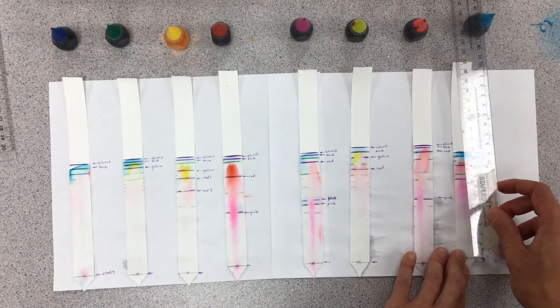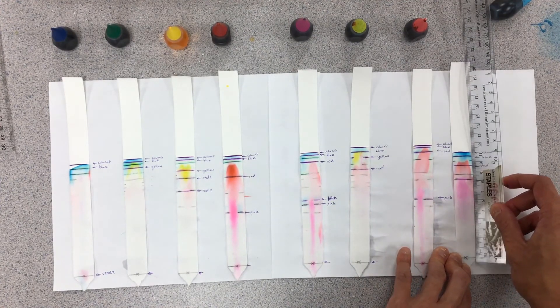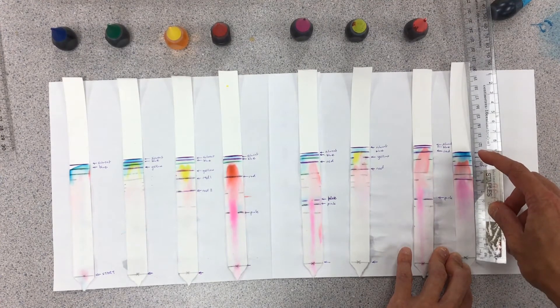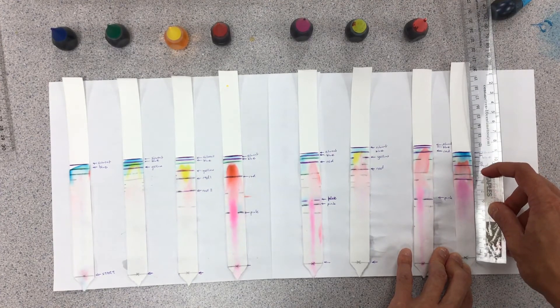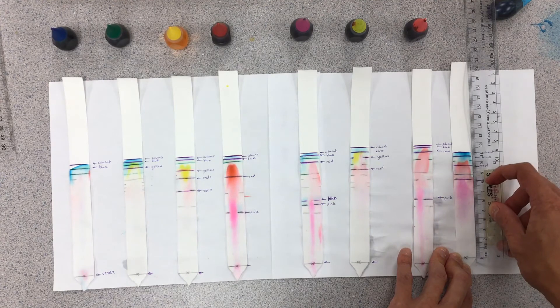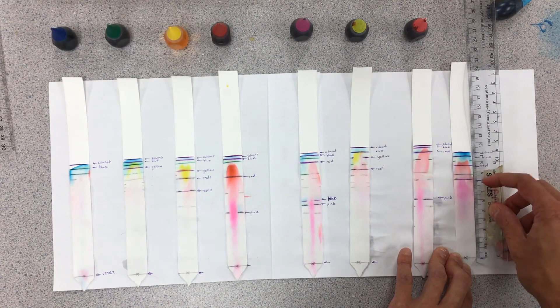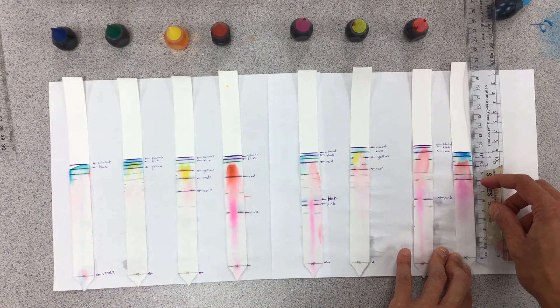The very last one, slightly off page. We have our starting line. Our solvent has gone upwards to about 11.6. We have a blue line, possibly maybe 10.7 or so, 9.6 for a red line. We have a pink line down here, that one is probably just over 8 centimeters, maybe 8.1 centimeters.